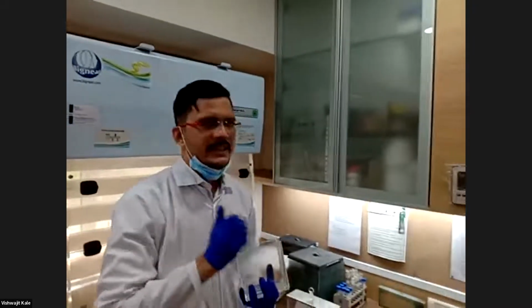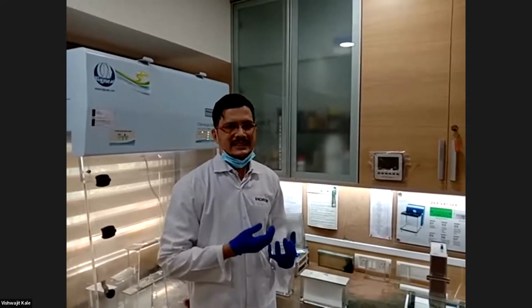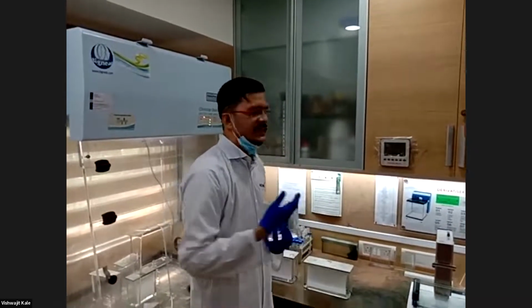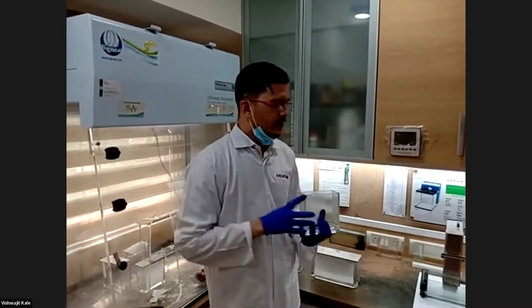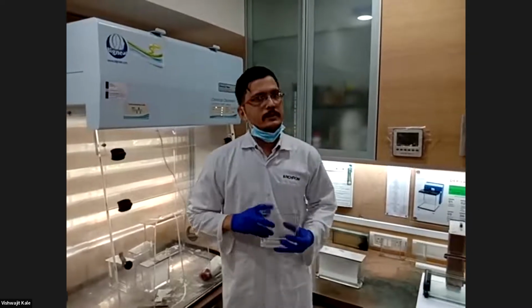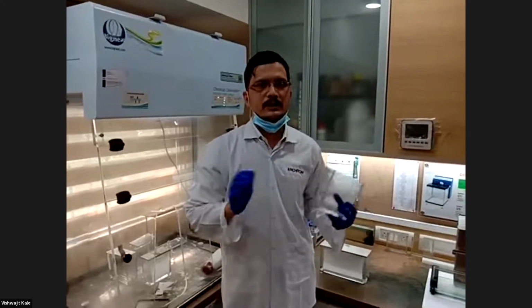So that is the key factor in HPTLC. We are not consuming more volumes of solvents like chloroform, methanol, etc., which are very much toxic towards environment. So we are not using higher volumes of that. So it is eco-friendly technique, and solvent cost, it is reducing drastically. So if we see the only 35 milliliters of mobile phase is required to analyze 15 to 20 samples on bigger plates, and only 20 milliliters of mobile phase is required for analysis of 15 to 20 samples on 20 by 10 plate.